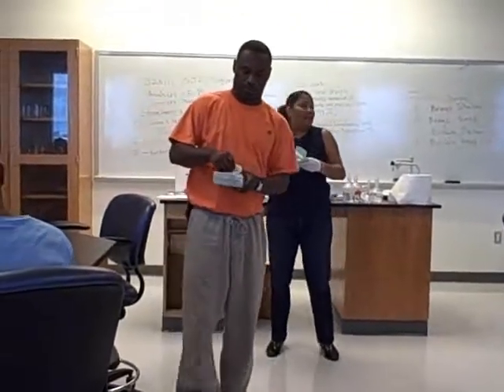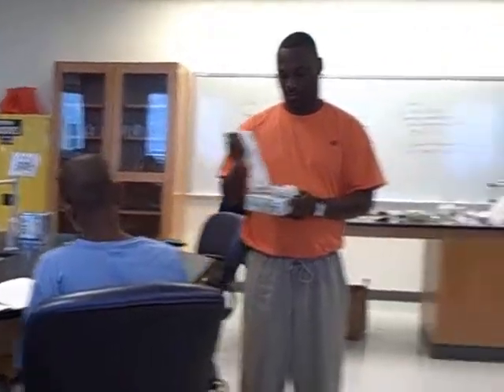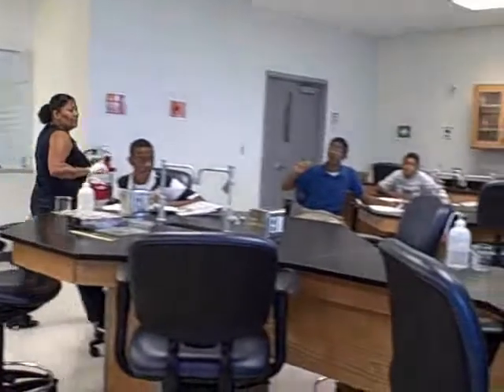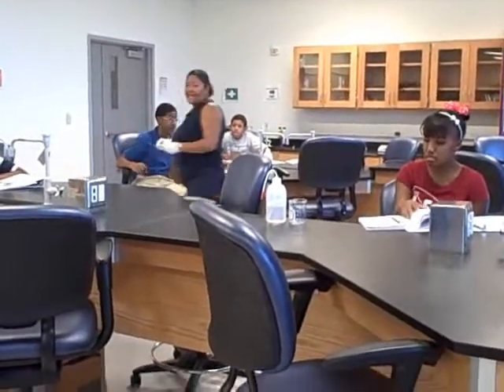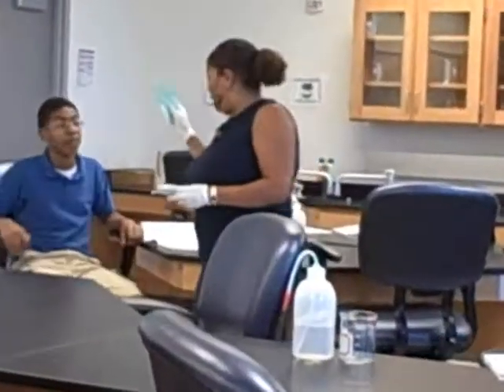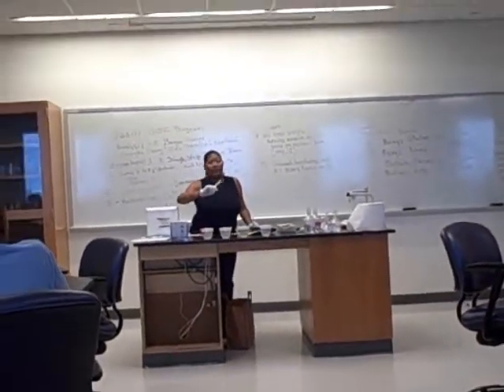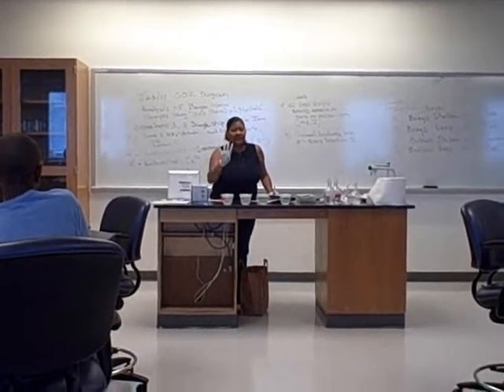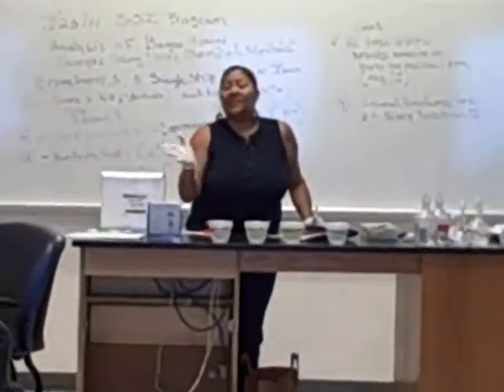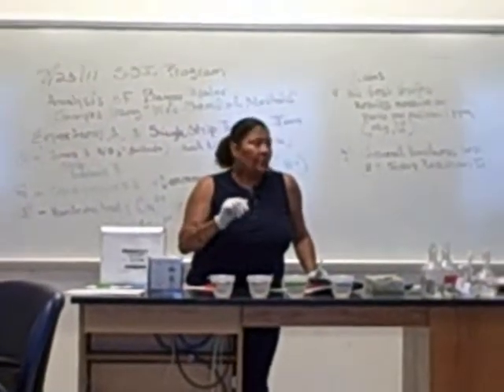Don't put your gloves on yet. What's the name of that acid? Anybody remember? It's okay to look in your notes. Good notes always mean I can use them. Do you have it? Say it for me. HCl. Students, repeat after me. HCl. HCl. Very good. $1 for you. $2 for you. That is hydrochloric acid. Now, Isaac here. The water samples originally had a pH of 7, but the hydrochloric acid was at a pH of 4. So the pH has now changed slightly. Should be a little lower.